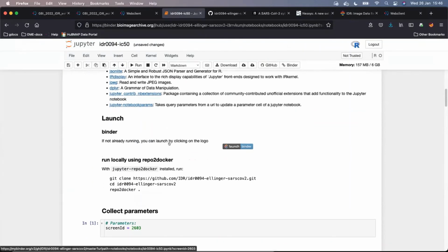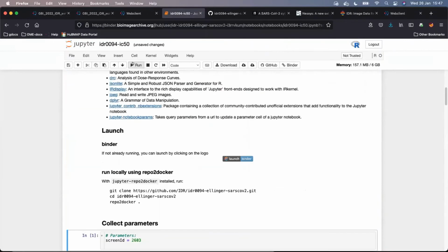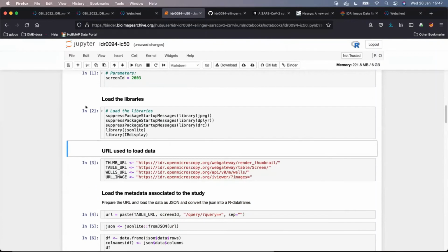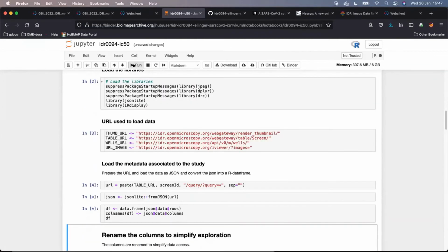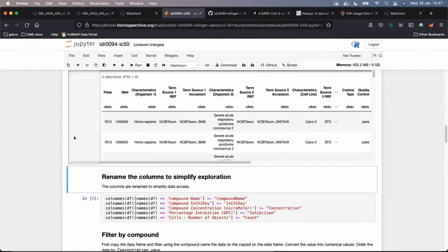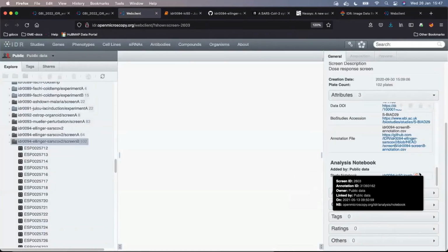And yes, I can now go and click on the cells here and start executing. If you do that, then please note that anytime I click on a cell, there is first a number. I click on that, there was a star for a short moment, then the star turned into a number again. And that means that the cell is done and dusted. And I can go down to further cells. You can see the stars are persisting here. So this is the fetching, etc., etc. So I will leave you to play with that.